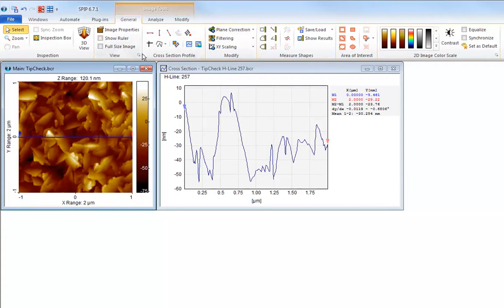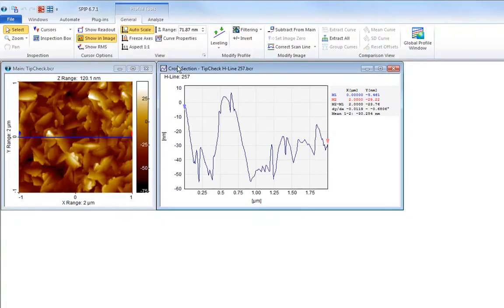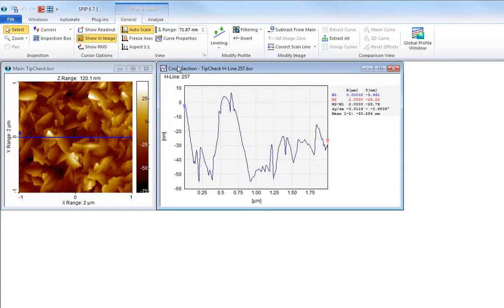When the profile window is selected another group of ribbon tabs appear with different tools. In this case there are so few data manipulation functions that we put them all on the general tab instead of making a dedicated modify tab.